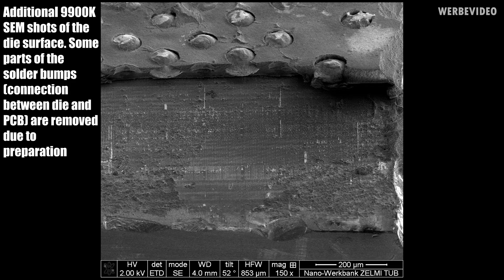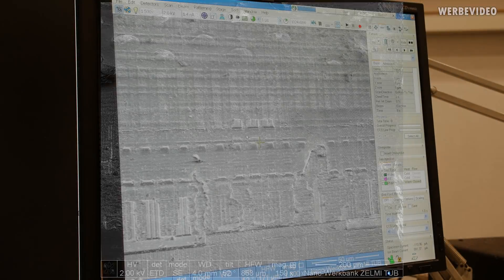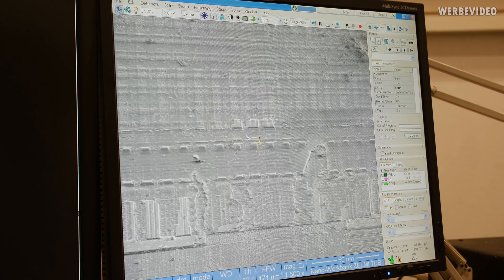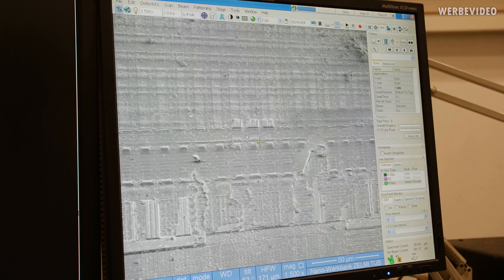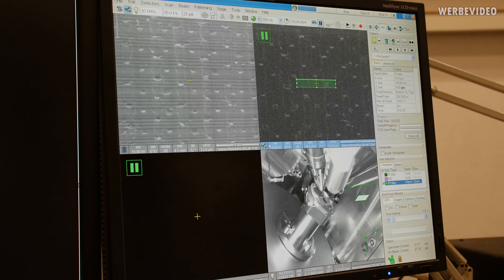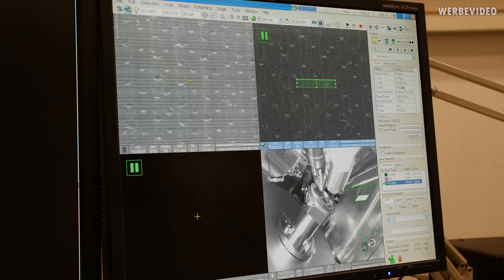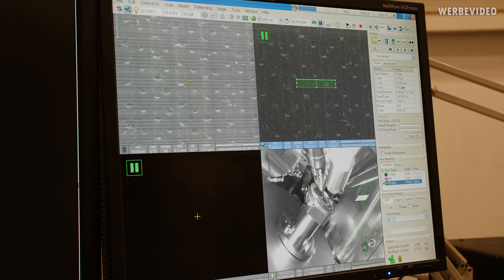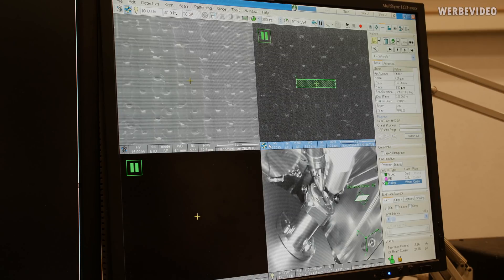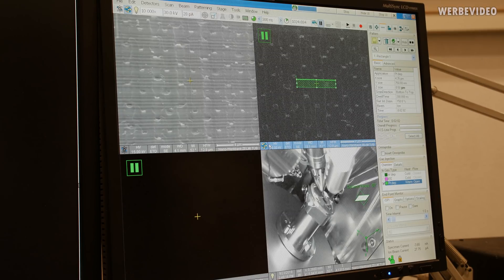So we will remove now some of the material. So we are digging a hole into the sample. And then we are looking at the cross-section surface. And then we will see the depth layers of the semiconductors. So in the next step, we're going to try to analyze our semiconductor structures with the SEM. And for this purpose, we're going to remove some of the material, so that we can look at the semiconductor structures in the cross-section.